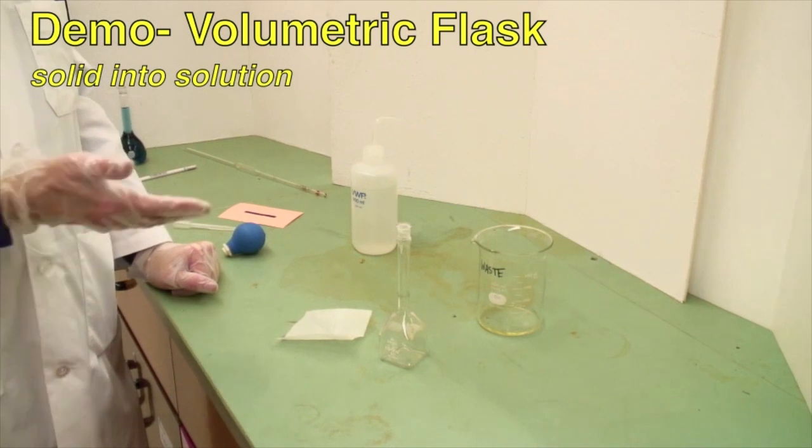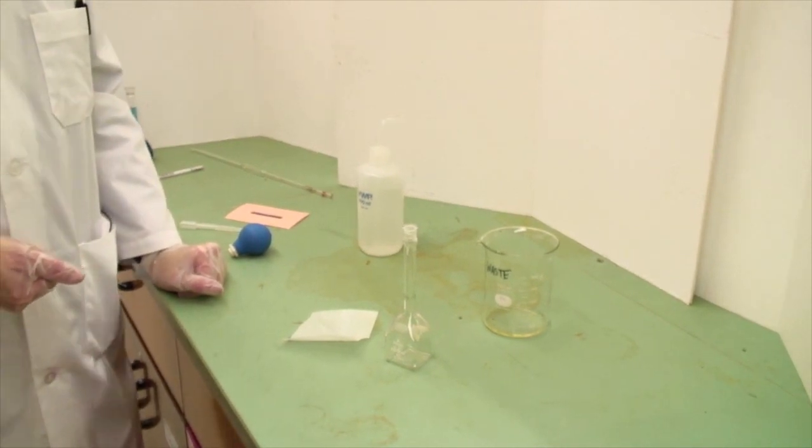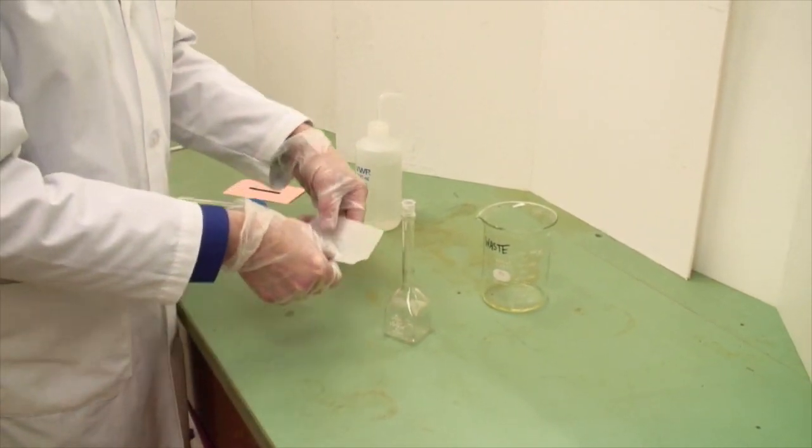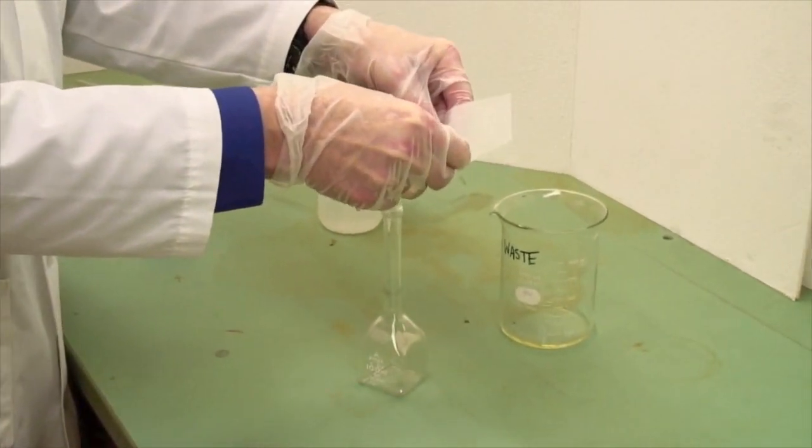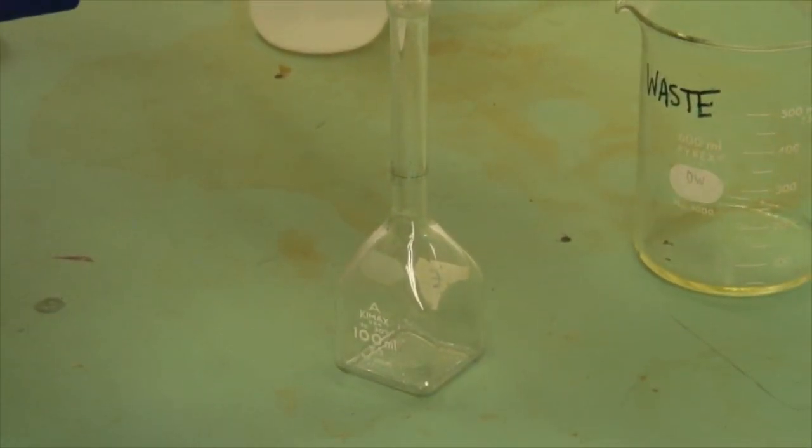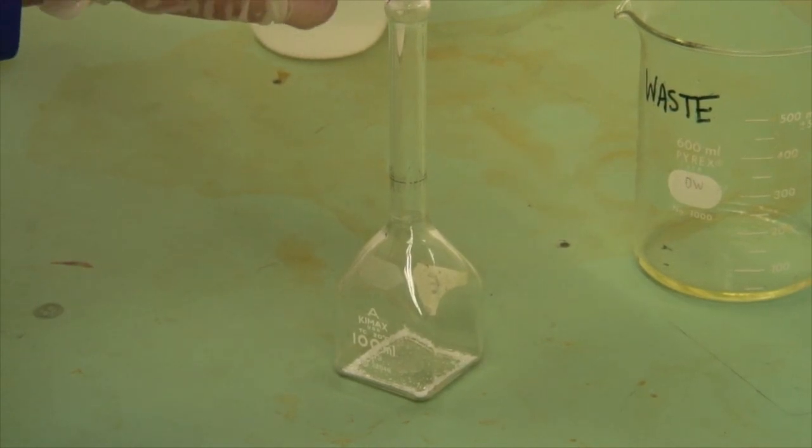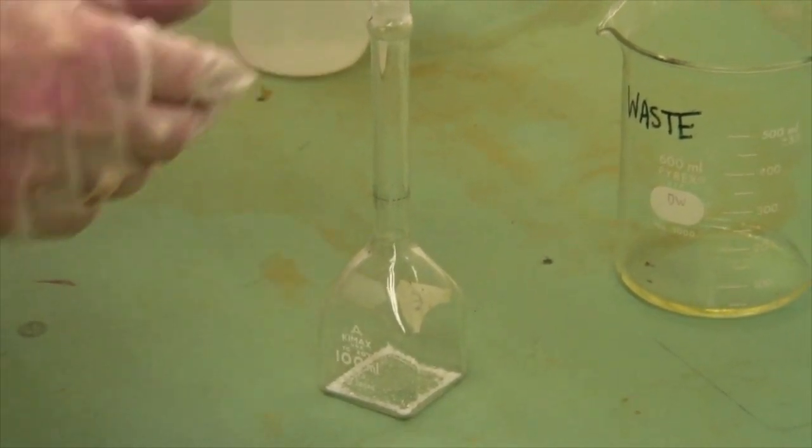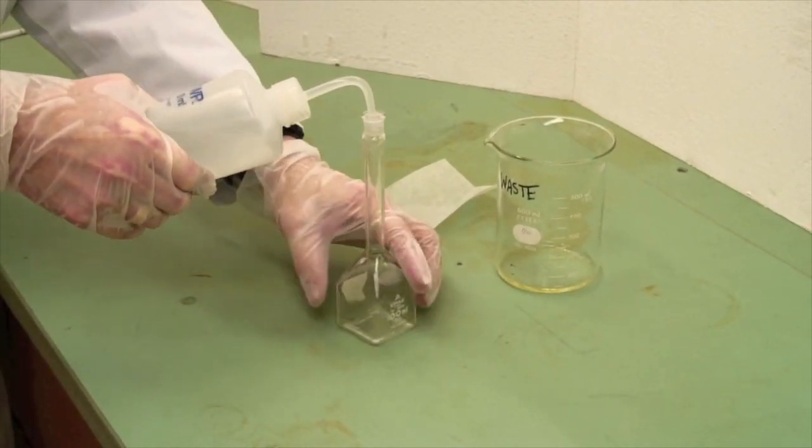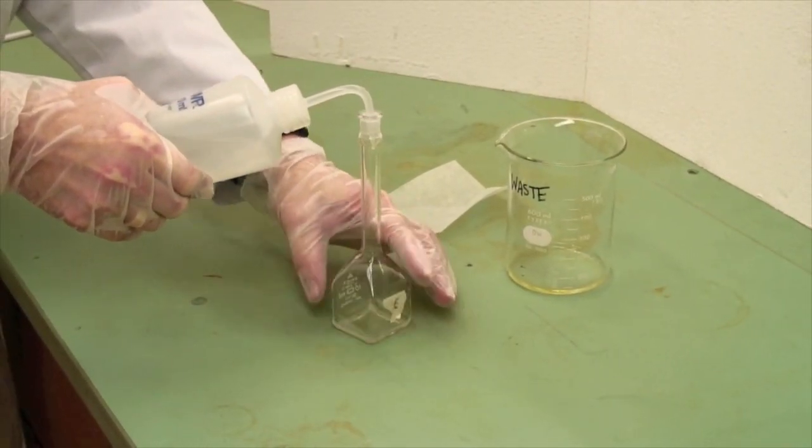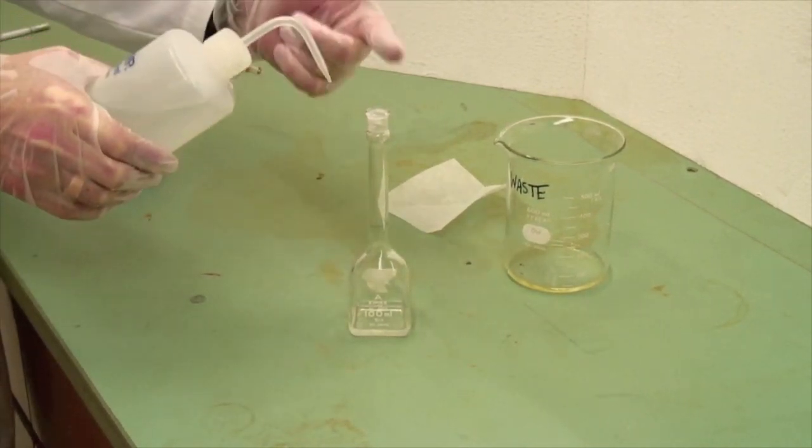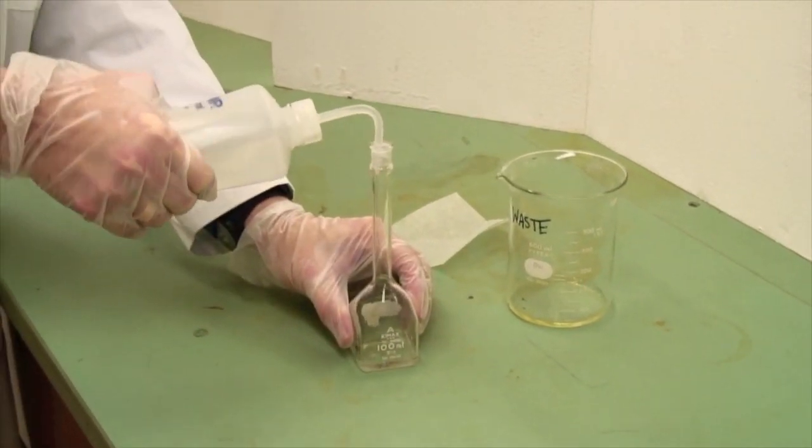Now here I've got a previously weighed amount of solid. And we dispense this carefully into the volumetric flask itself. Make sure that everything comes off. And again, use your squeeze bottle to wash everything down inside. If you used a funnel to get this in, use the wash bottle to rinse the funnel to make sure that everything has gone inside.